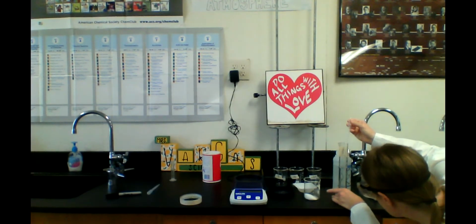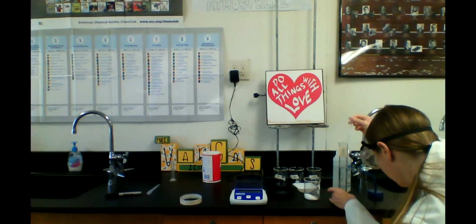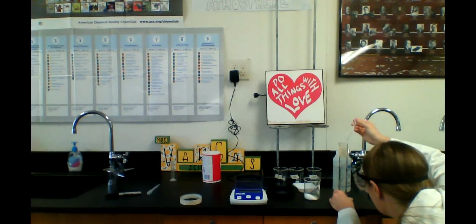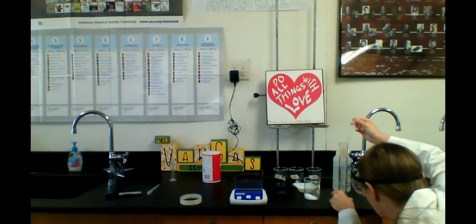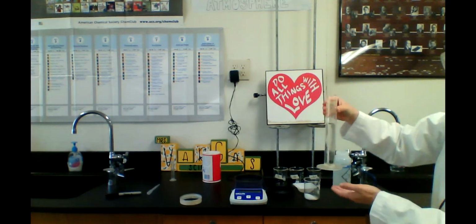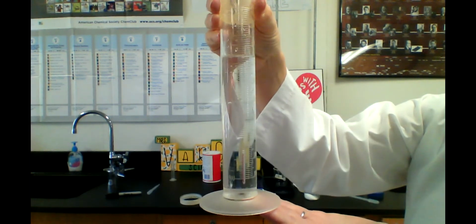Okay, and notice how I'm getting down to eye level. The meniscus is the name of the curve of the water. And we always want to read from the bottom of the meniscus. I'm at 74. From the bottom of the meniscus, we want that right in line with that 75 mark. Okay, and there we go. So we get down to eye level, and we want to look straight on and make sure that it is 75. Okay, and I'm going to pour that into my beaker.